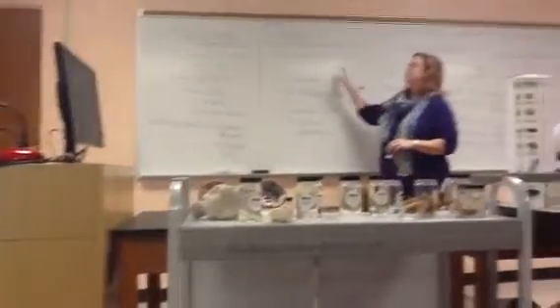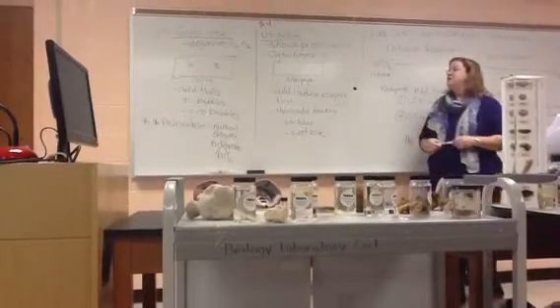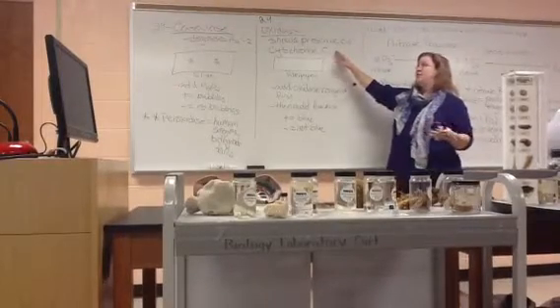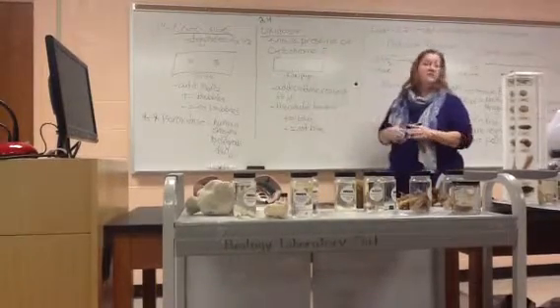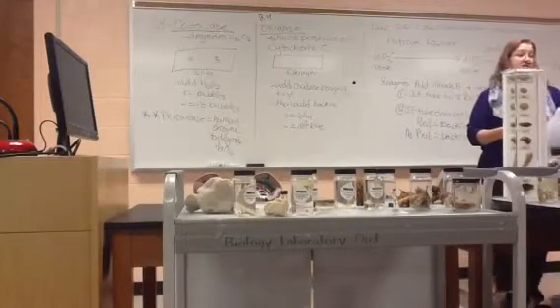Okay, still in lab 24, the second enzyme that we're going to look at is oxidase. This particular enzyme is present in bacteria that have cytochrome C. So if they produce oxidase, if they make this enzyme, that means that they have this protein, cytochrome C. And cytochrome C is a member of the electron transport chain.